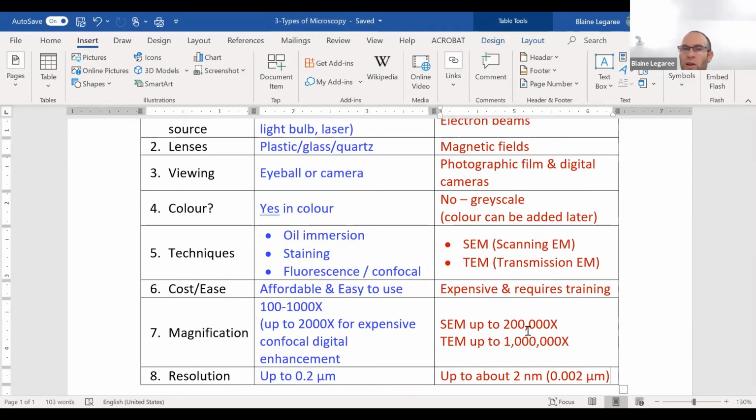Another really important thing for these types of questions, if this was a midterm question, is that I expect you to give me examples. So don't just say, well, under a light microscope you can see a cell. Oh, and under a scanning electron microscope you can see a cell. Okay, that's great. That's just not very specific. Give me an idea of what you're looking at.